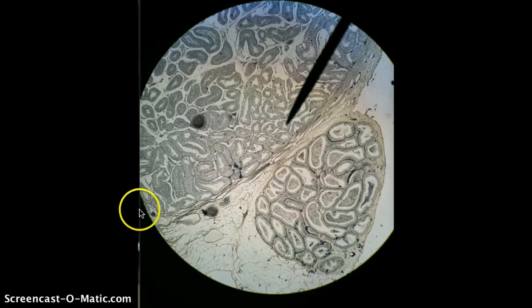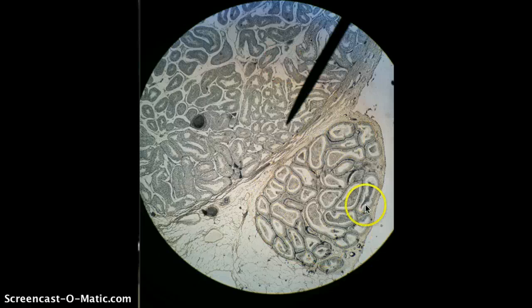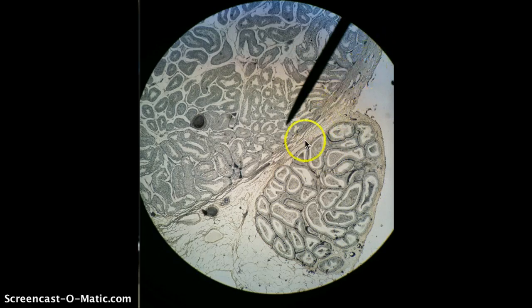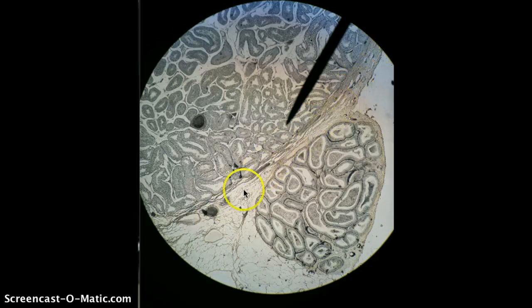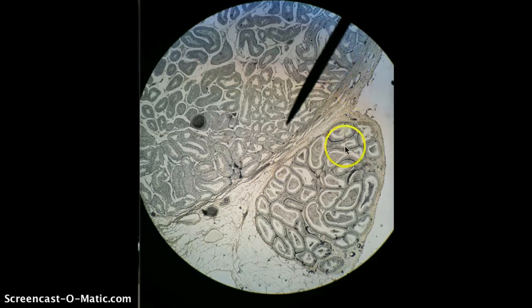In this view we can see two organs. The one up here is the testicle, and the one down here is the epididymis. The dividing line between them is this connective tissue structure right here, which is called the tunica albuginea. This structure is the tunica albuginea, and it divides the testicle and the epididymis.